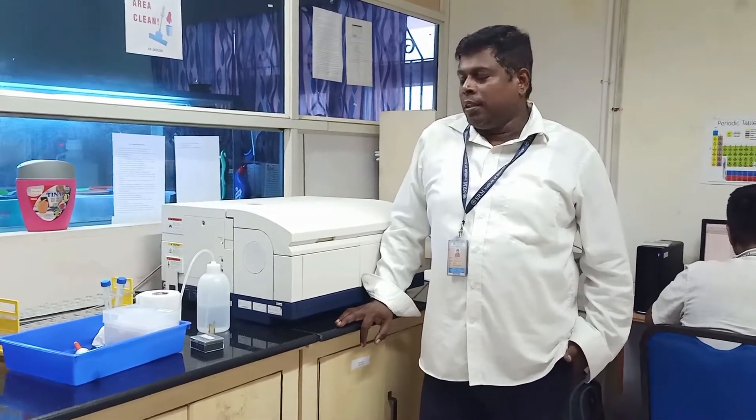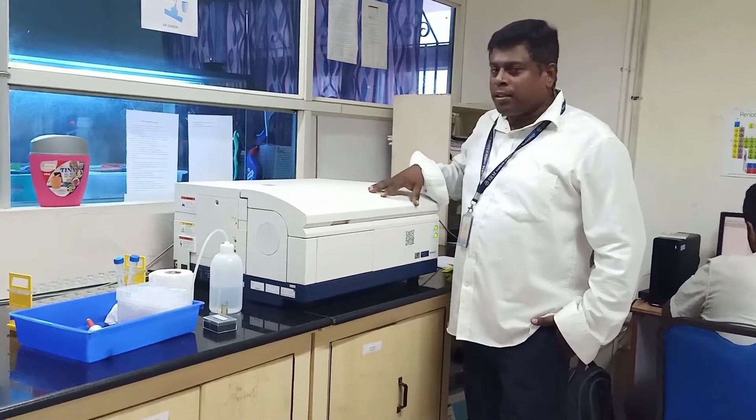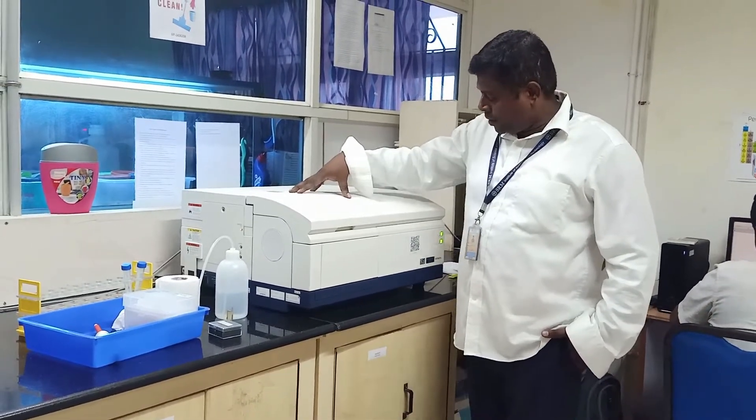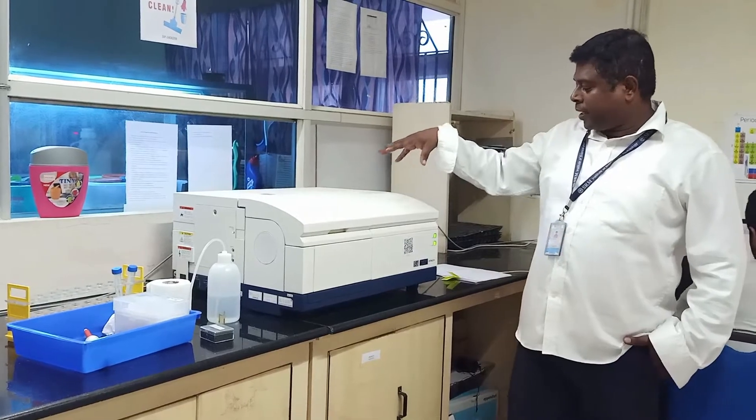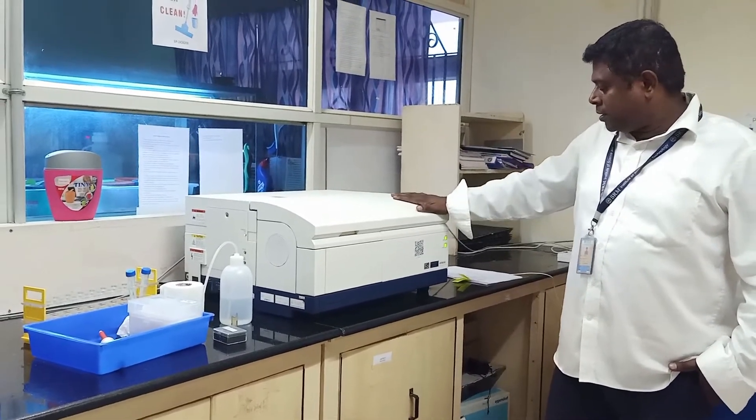Welcome to the Membrane Protein Interaction Lab. I will show you the instrumentation of the fluorescence spectrometer and how we can use this to measure fluorescence of a given sample. This is a fluorescence spectrometer, a product of Hitachi Japan, which has a model of F4500.